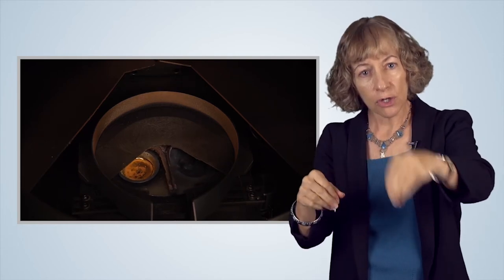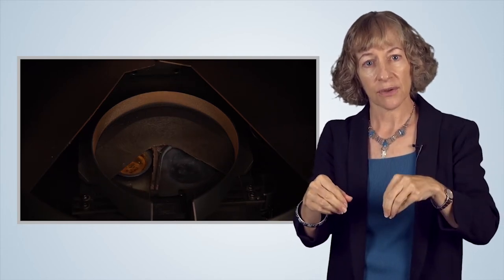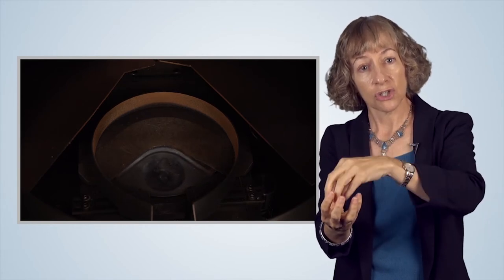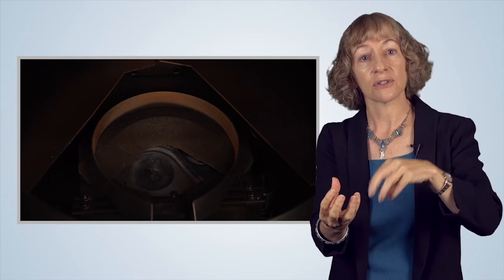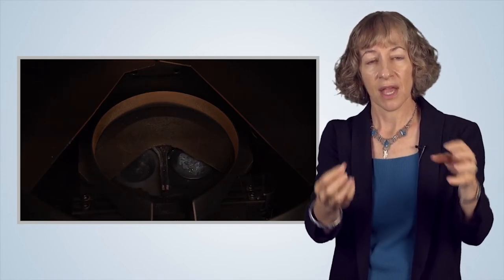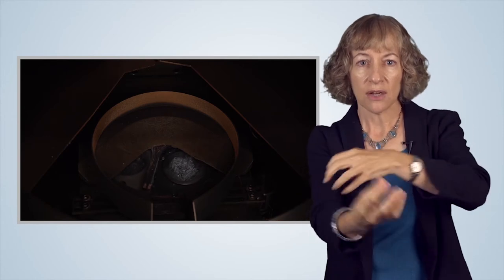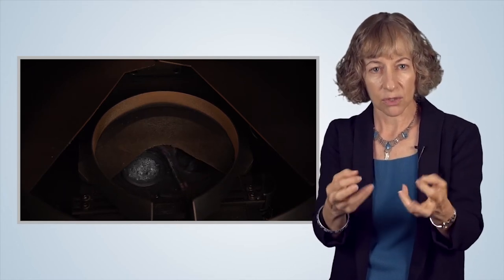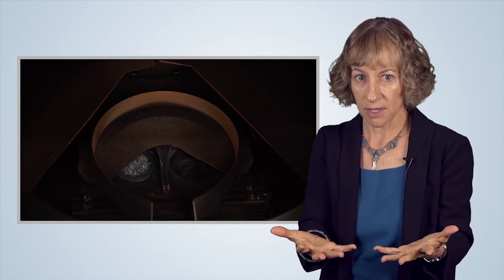There are four crucibles that fit into the hearth, and each crucible can hold a different source material, so that you can have up to four layers of different materials deposited without breaking vacuum. The hearth is a rotated holder of copper, which is water cooled. The water cooling prevents the crucible material from melting and mixing with the source material or with the hearth itself.